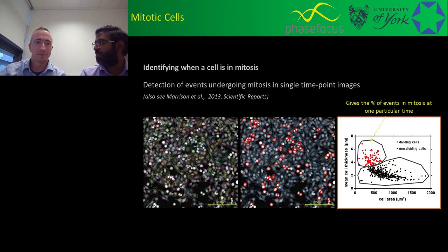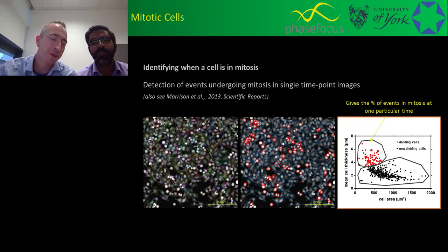There was a time before Rakesh, with cytometry as well. As a flow cytometrist, one of the things we thought in the very early days was that we could look at apoptosis and cell cycle without staining, because we knew we'd see a mass change, volume change, and refractive index change, which is really critical to this.